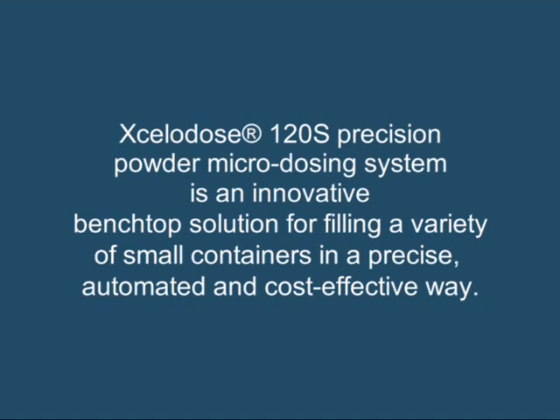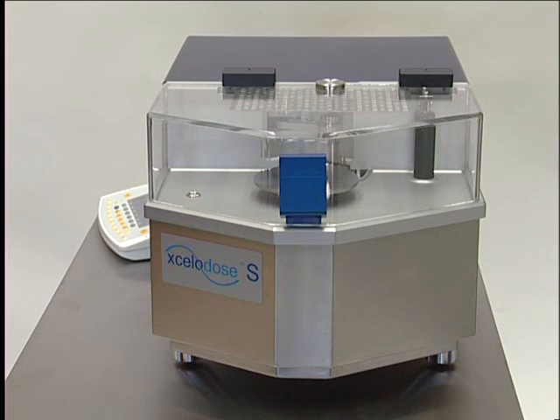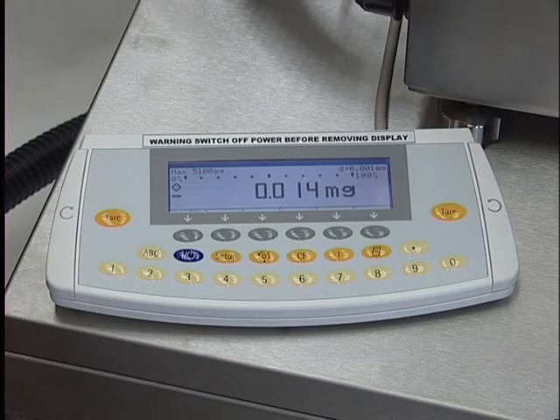The Accelidose 120S system has helped speed up the drug development process and enables pharmaceutical companies to achieve even faster time to first in human, the key go-no-go decision point of phase 1 clinical studies for the development of new molecules.